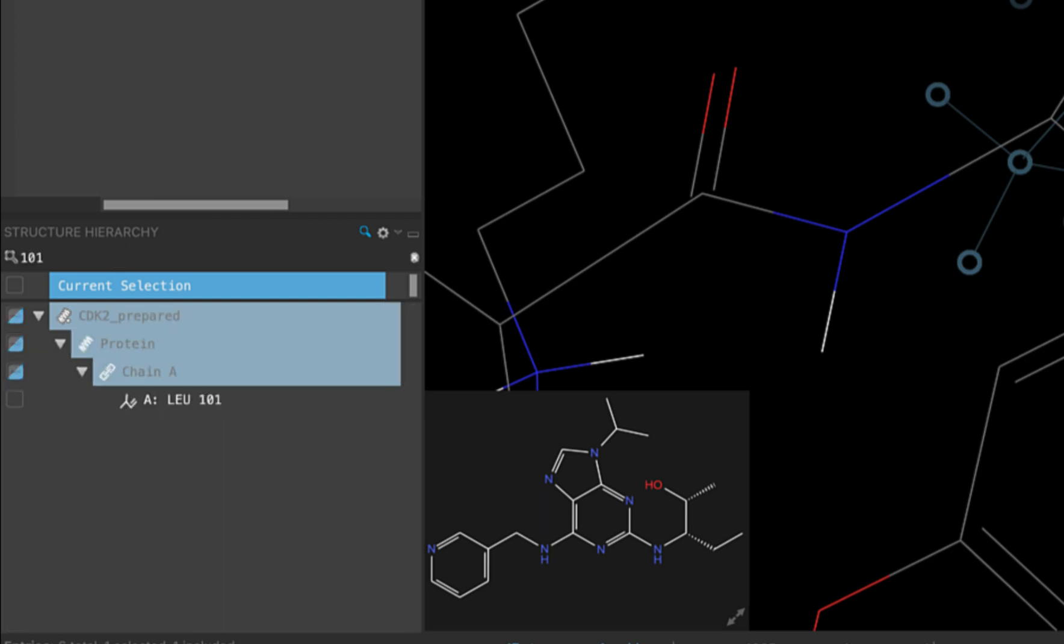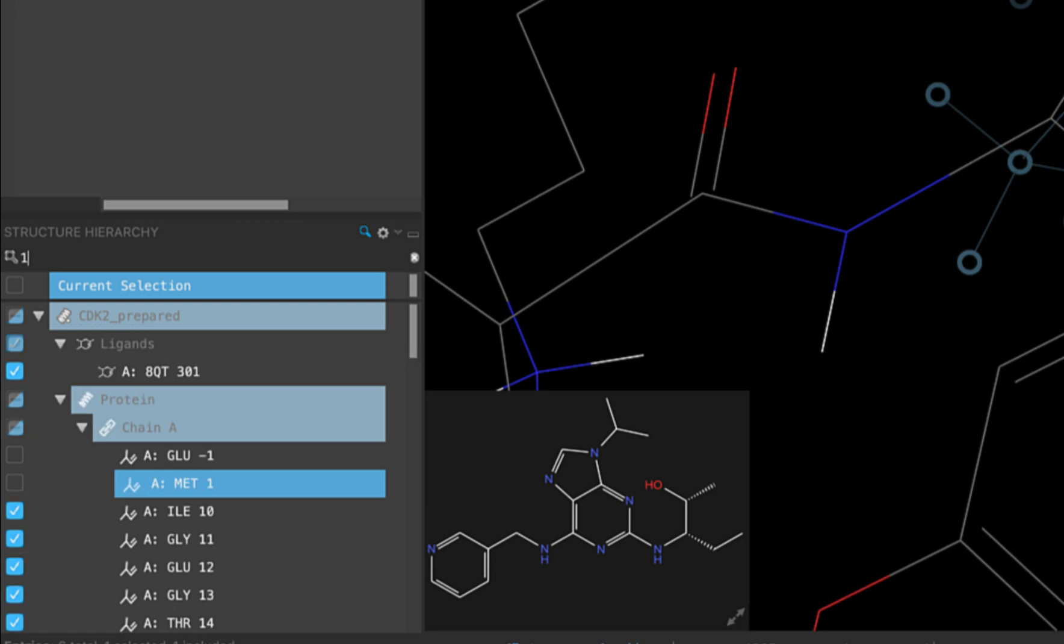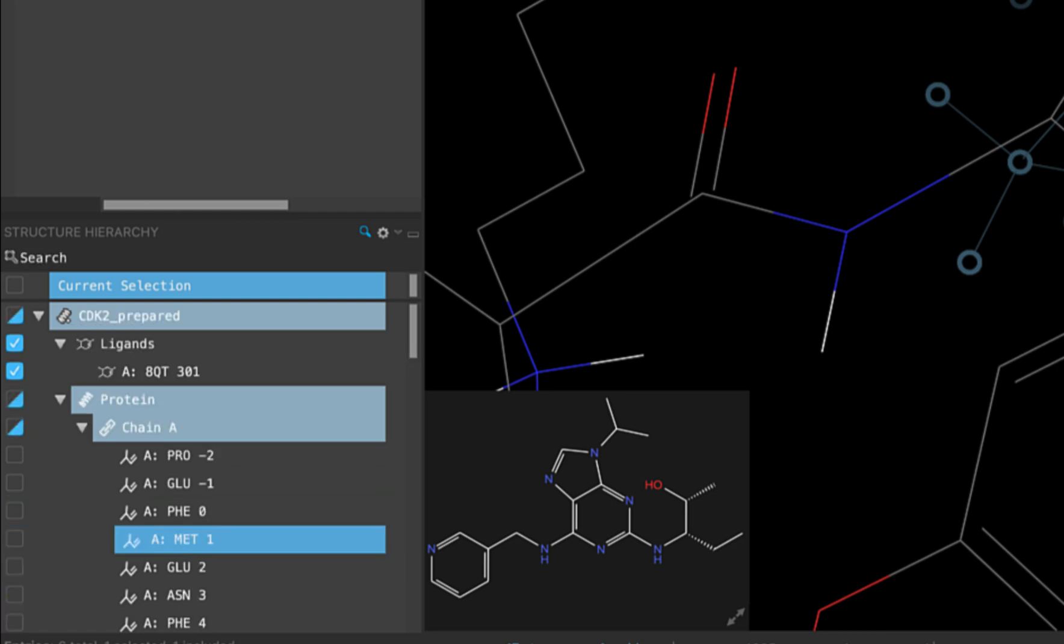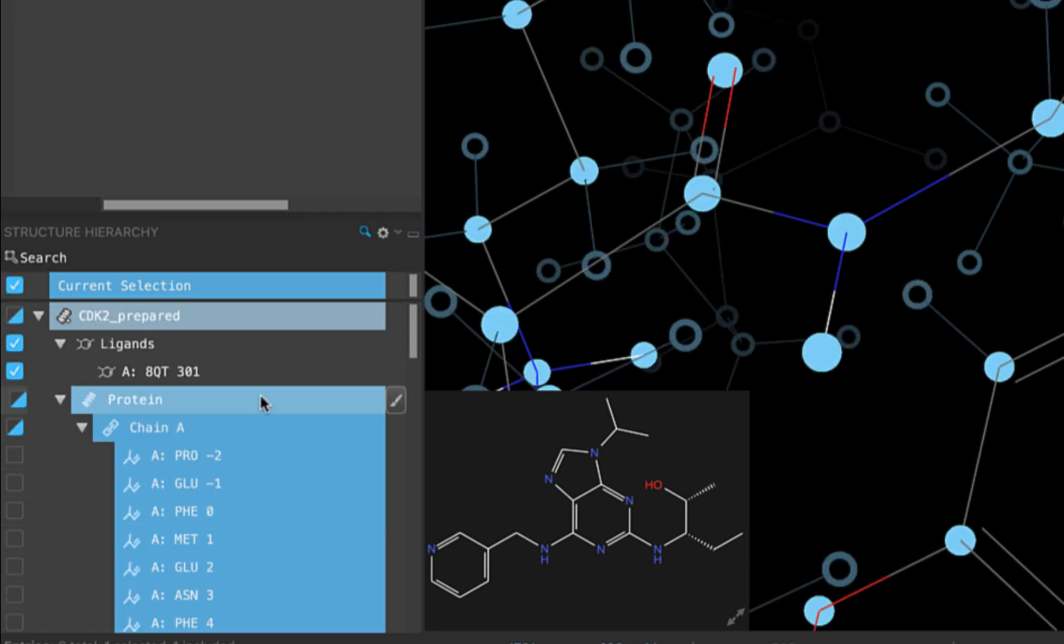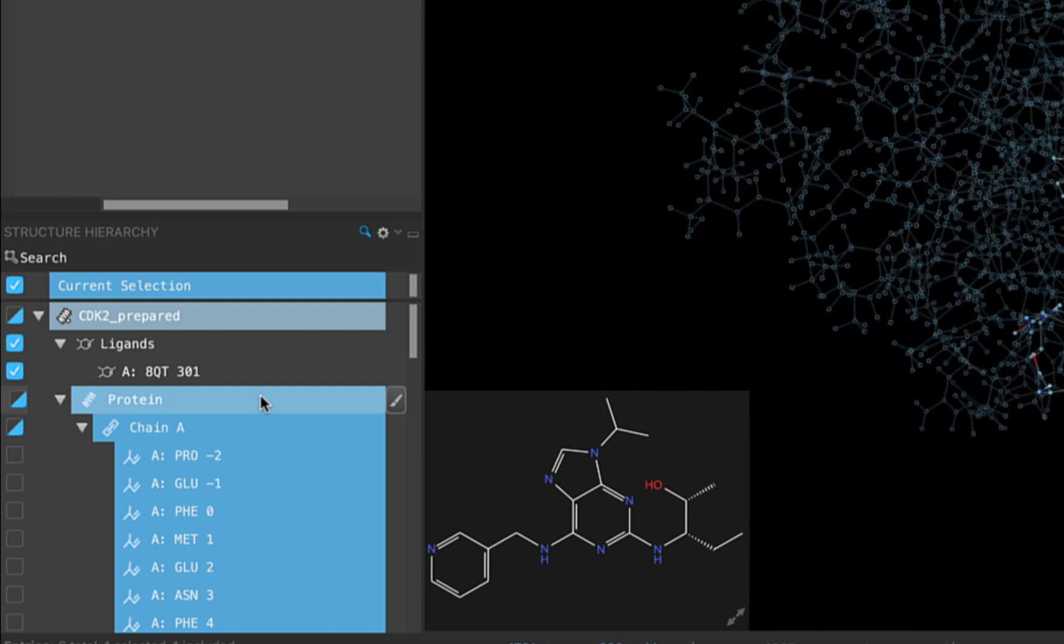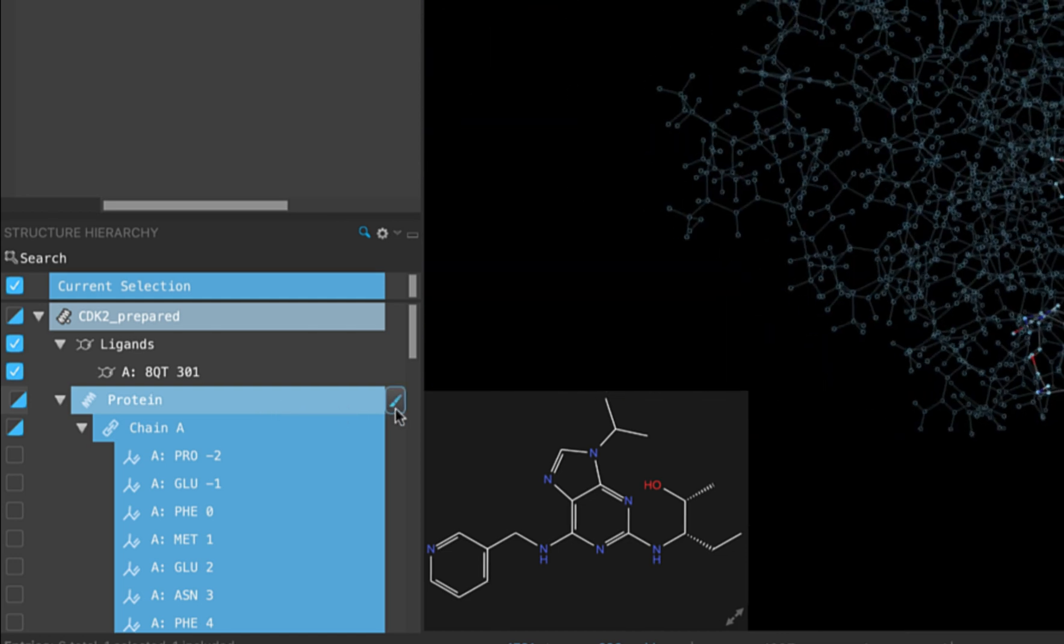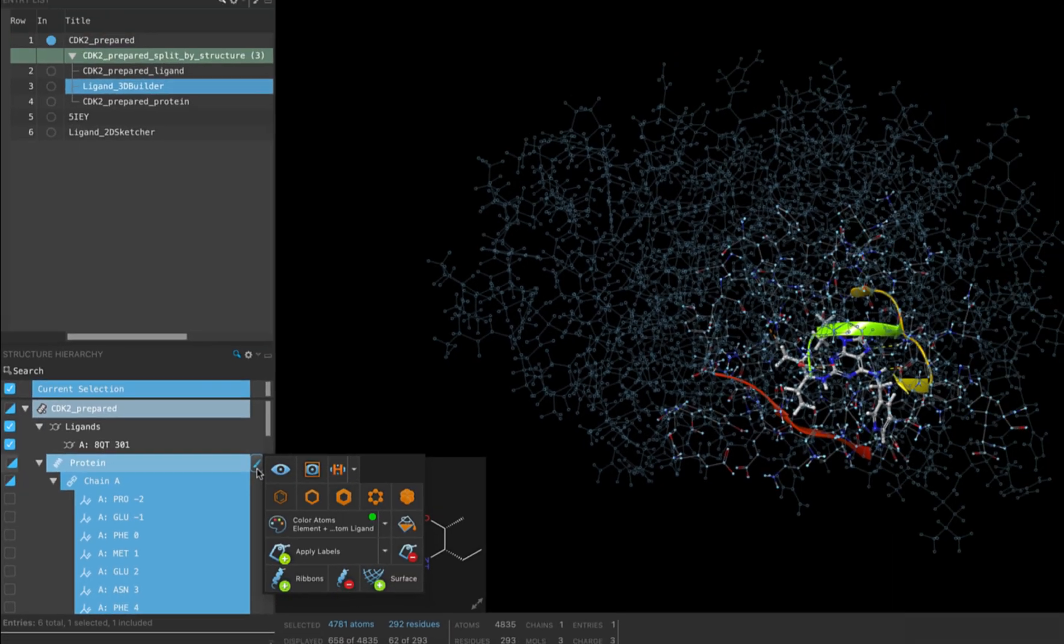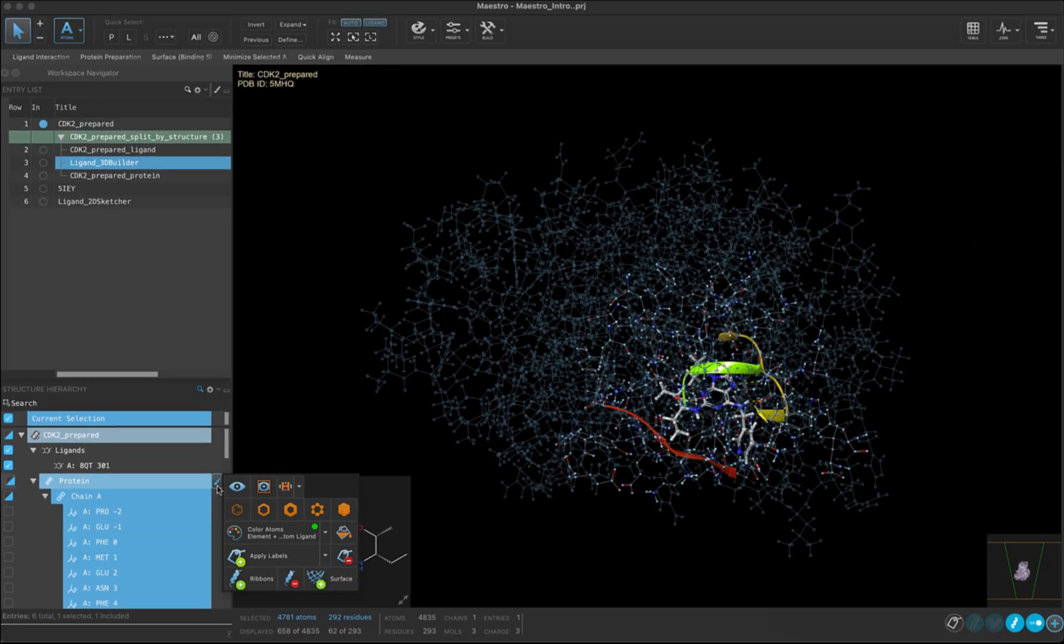Since we want to change just how the protein is displayed, we can select and hover over the protein then click on the plus sign. We have an option here to change the view of the protein atoms in the same way that we do in the style toolbar. Right now, we can see only some of the protein atoms, which doesn't mean that the others aren't there, just that they are not displayed.